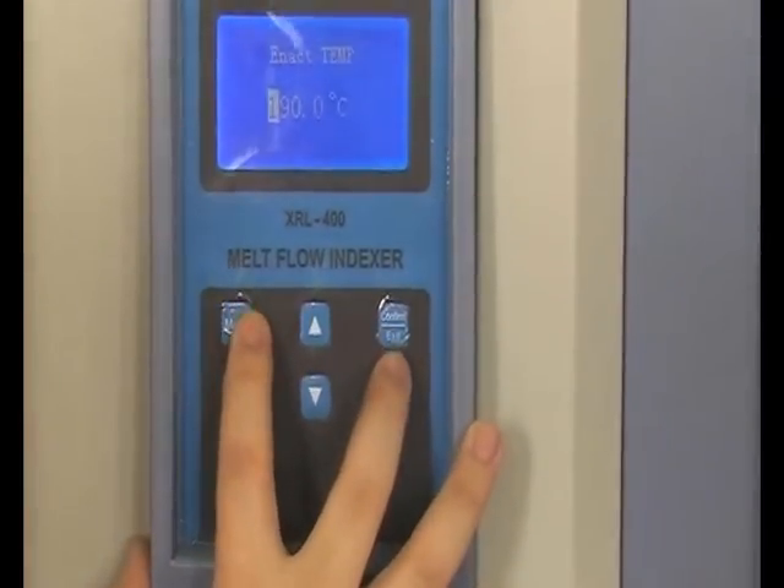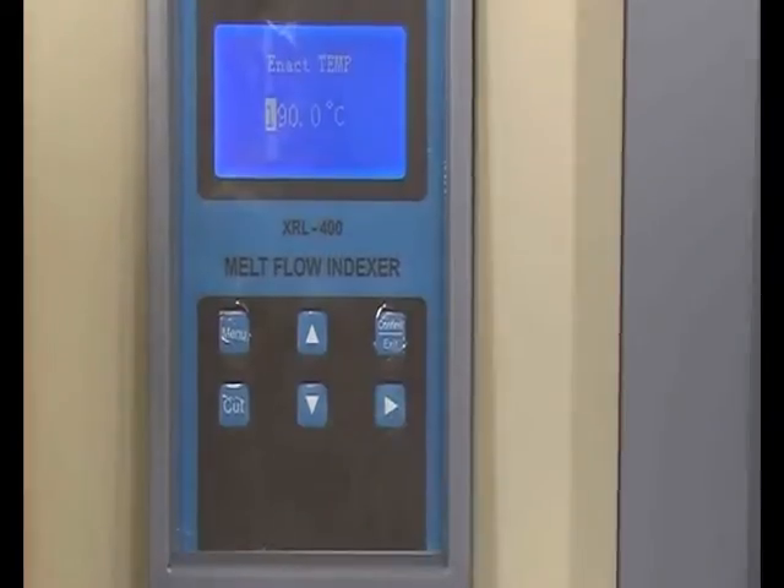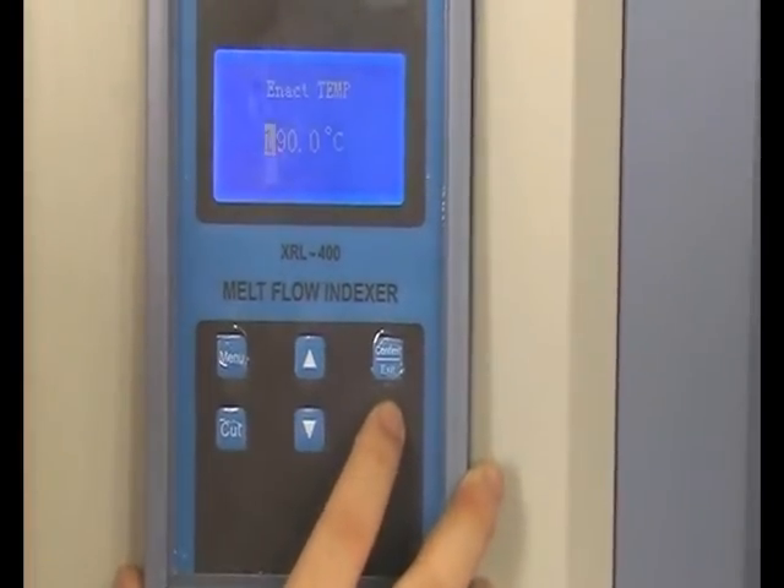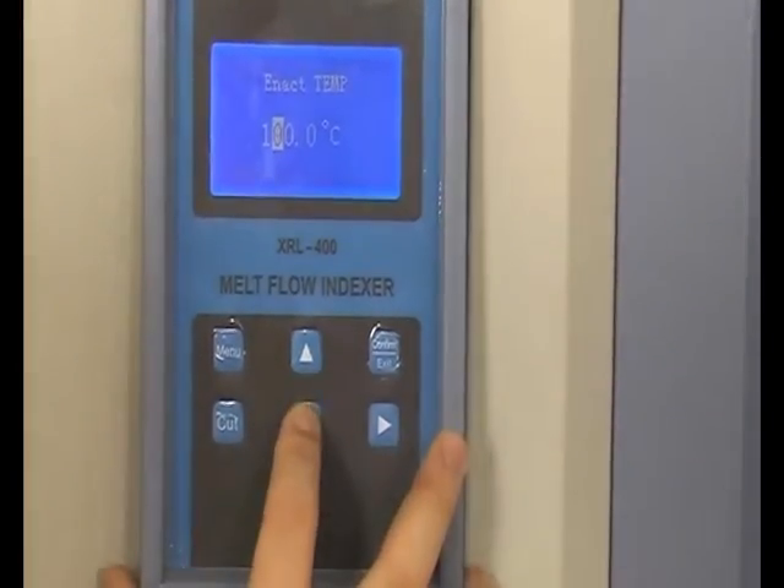You can adjust the number by up and down keys. Press the right button to change the cursor's position. After setting, press the exit button to confirm it.